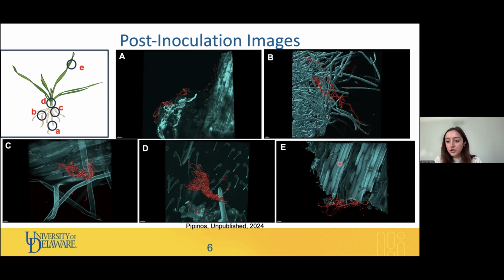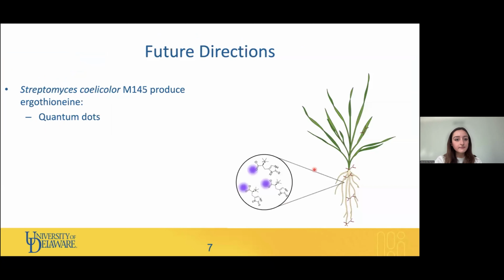And then lastly, we looked at the spring wheat shoots. So this was the leaf of the plant, and you see that there is colonization at this exposed region where I cut the plant for imaging. So either Streptomyces was endophytic at this point, and when we cut it, the colony was exposed, or the moisture in the in vitro environment that we grow our plants in could have caused the transfer of Streptomyces from the roots to the shoots via water or some other mechanism.